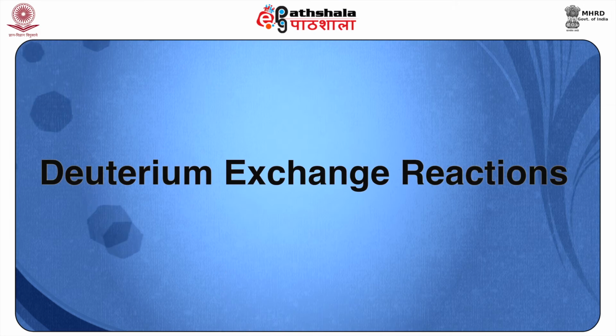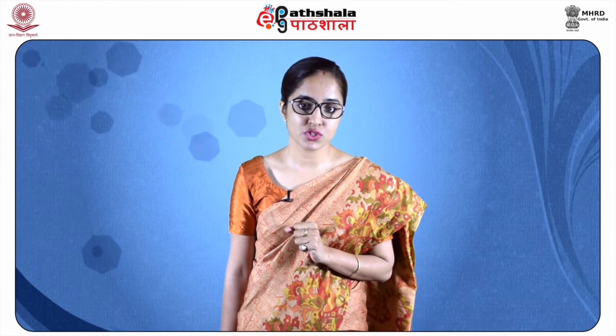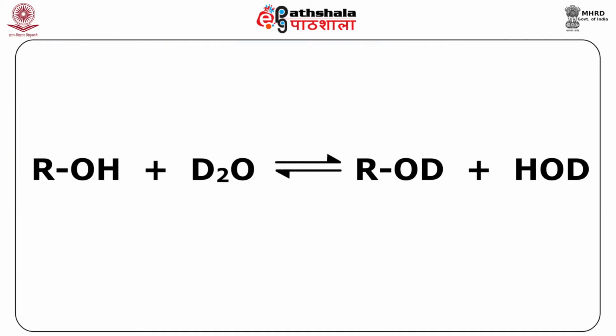Next, we come to the study of deuterium exchange reactions. Deuterium, the heavier isotope of hydrogen, can help in the simplification of the spectra. Deuterium exchange is the most elementary and very useful technique for assigning the protons of hydroxyl, amine and SH, that is thiol, groups, which are exchangeable with deuterium.